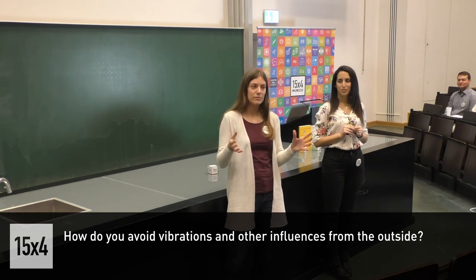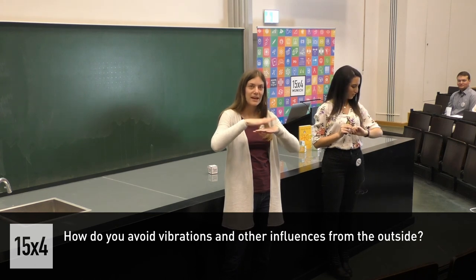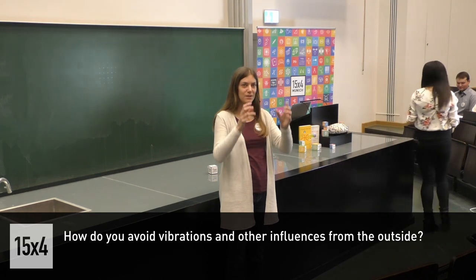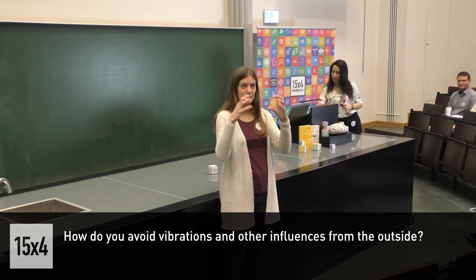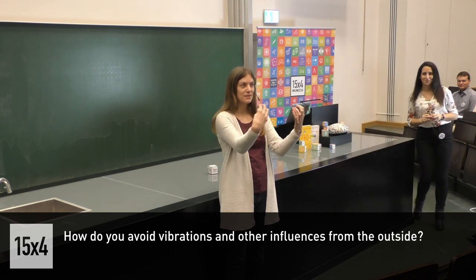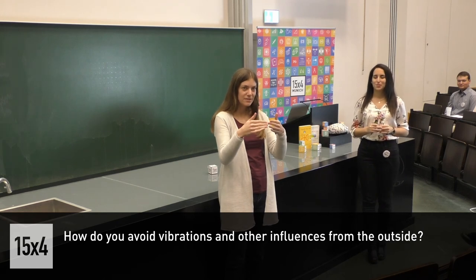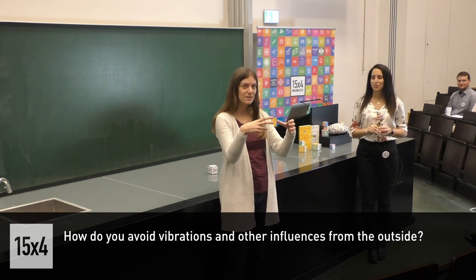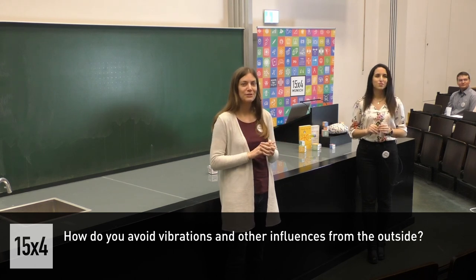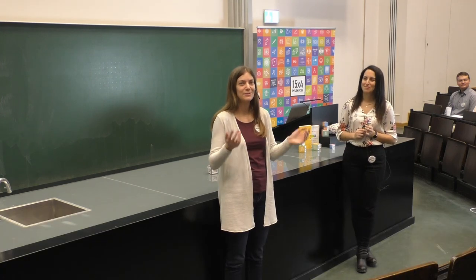The other thing is we have this whole machine on soft dampening legs so that the vibrations are isolated, and then inside the chamber the STM itself, the microscope itself, is hanging on springs, and there are some magnets that damp the motion, so if we hit it a little bit, the magnets will compensate and stop the shaking very quickly. If you have a bad day, you can see every time somebody claps, but on a normal day, it's fine.